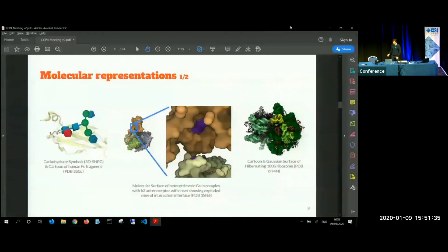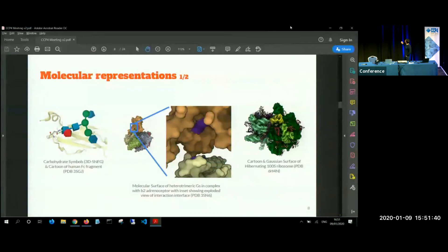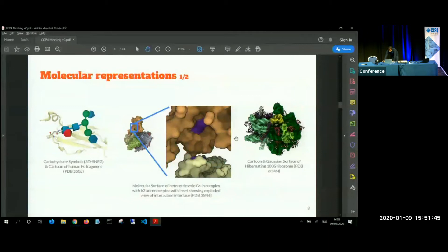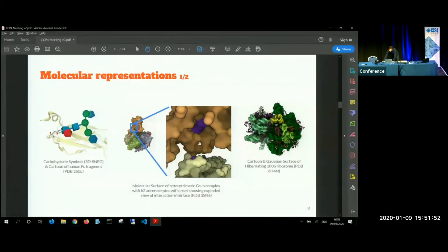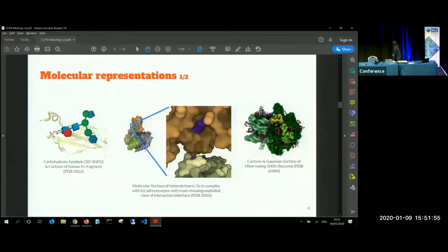Now, another thing would be interactive or interesting annotations of the data. For example, the purple spot here would show exploded view of interaction between two chains in a molecular complex. Or we can even show very nice images of the whole ribosomes as surfaces.